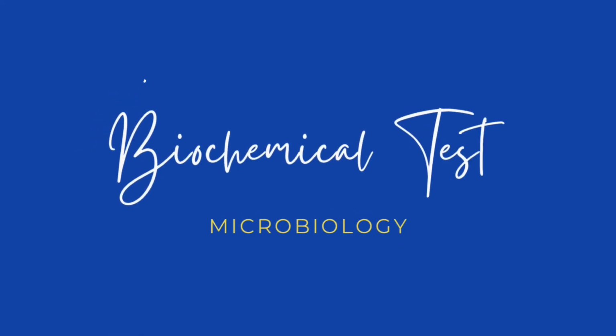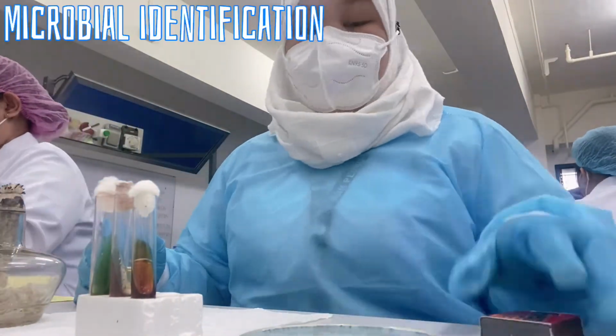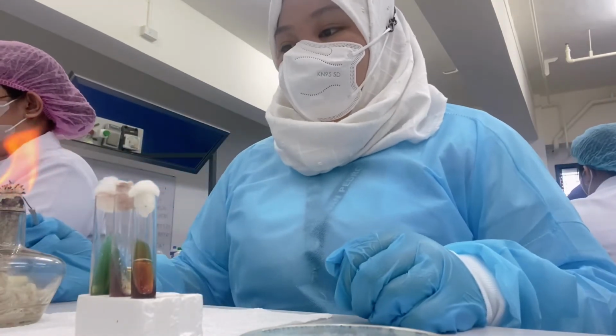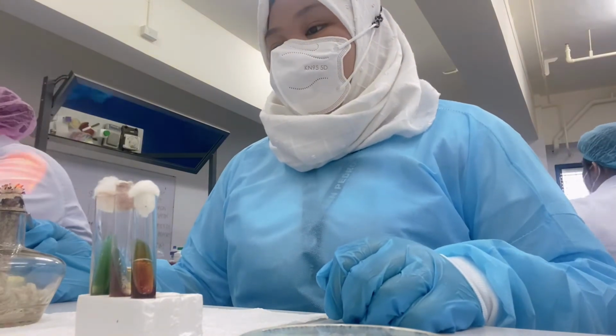And lastly is biochemical tests. These tests are among the most important methods for microbial identification. Some of these tests are the TSI, LIA, citrate, urease, and SIM.